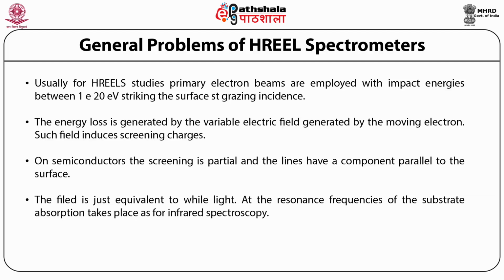At the resonance frequencies of the substrate, absorption takes place, as far as infrared spectroscopy is concerned, and for HREELS as well. Such energy is lost by the electrons.